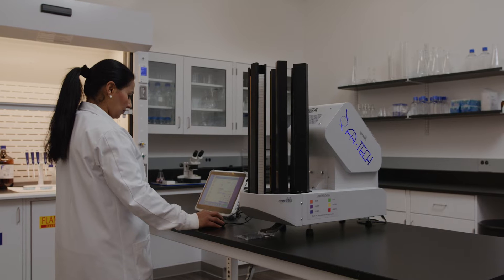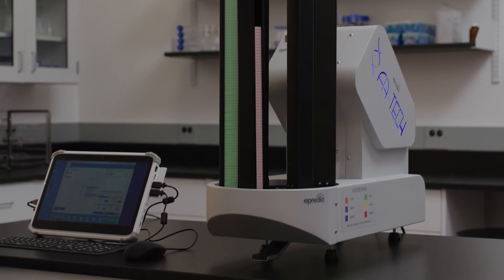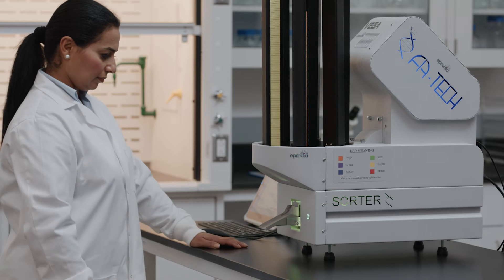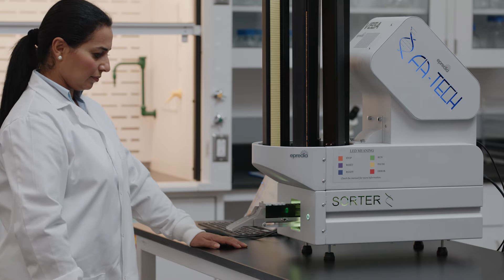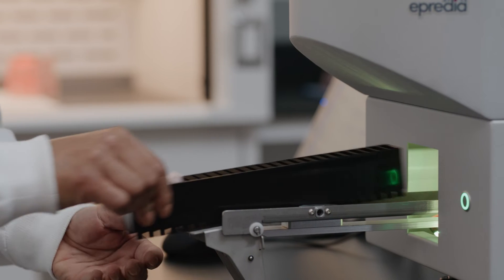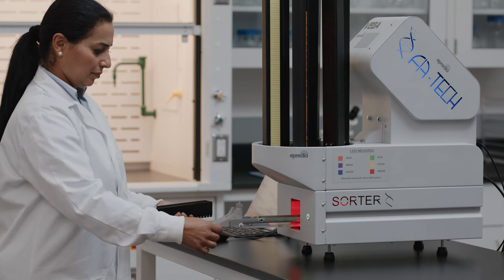They can be selected manually or automatically when connected to the LIMS. The Cassette Sorter accessory can improve batch printing workflows by organizing up to 25 cassettes in the sorting trays.